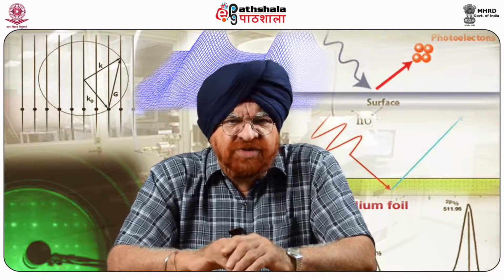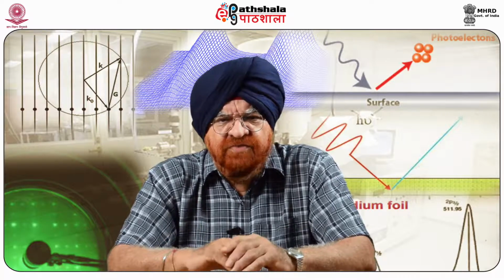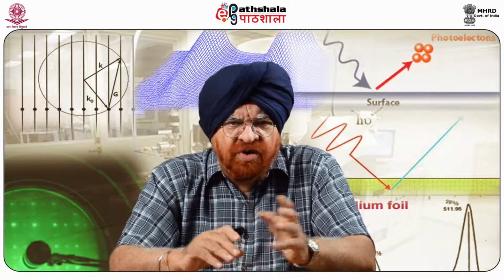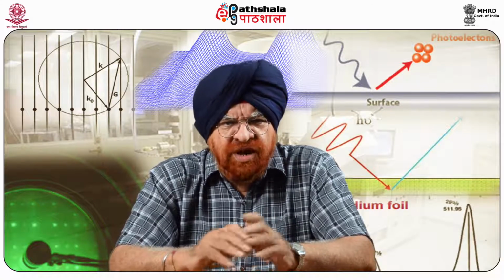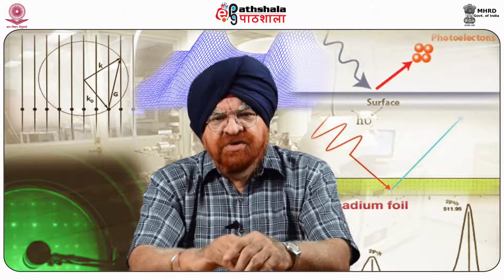The potential of these microscopes for revealing the details of structures is illustrated by atomic resolution images, including that of graphite or an organic conductor, an insulator, a layered compound, and individual adsorbed oxygen atoms on a semiconductor, of course.